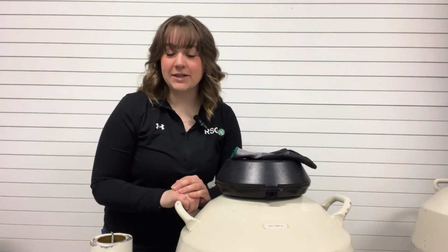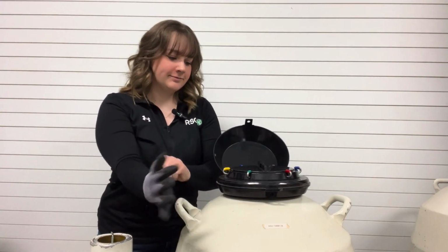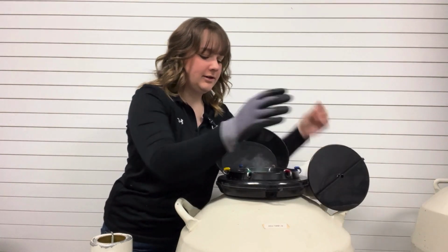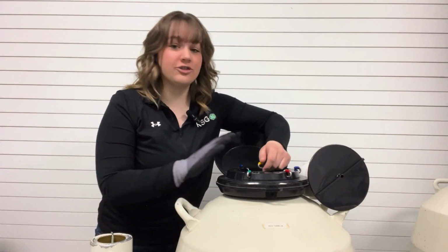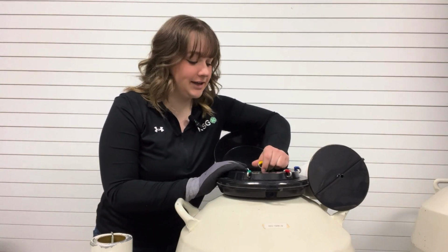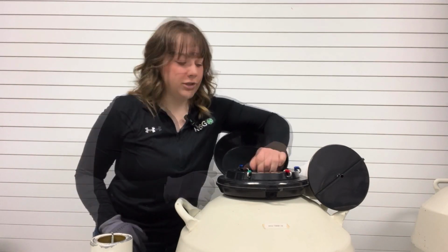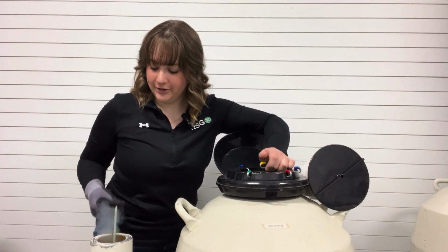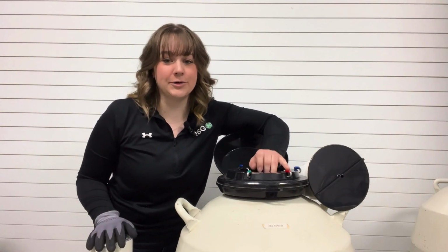Now we're going to locate the semen that we need in our canister. So we're going to put our glove on, take the foam out, and we're going to move the canister that we need to the middle of our tank. Take a look inside of our canister, being sure to keep the canister below the frost line in the tank. Once we've identified what it is that we're looking for in the canister, we're ready to move our semen. You want to make sure that you can pull up easily on both canisters, because once you've placed your semen, you're going to want to put the canister back down in the nitrogen as soon as possible.